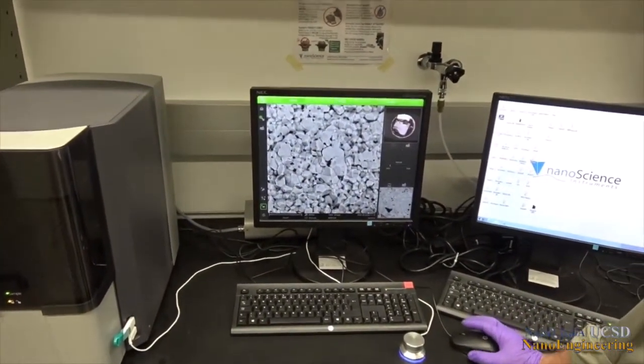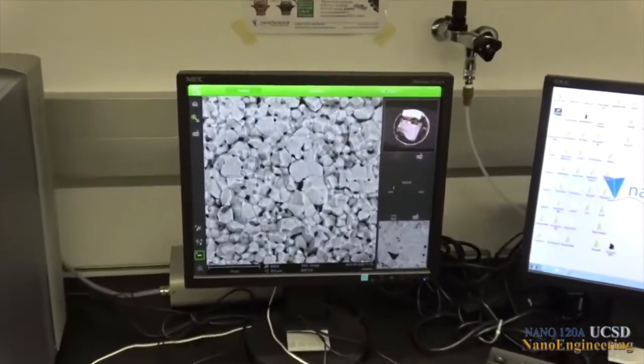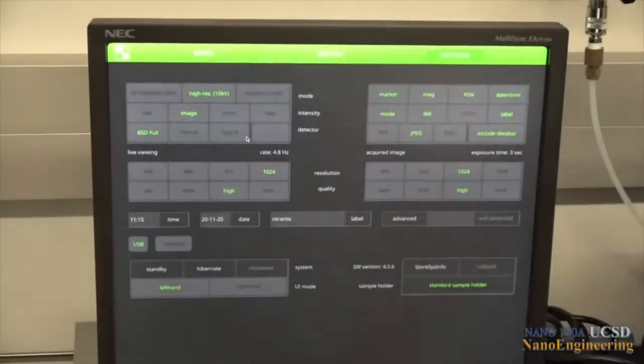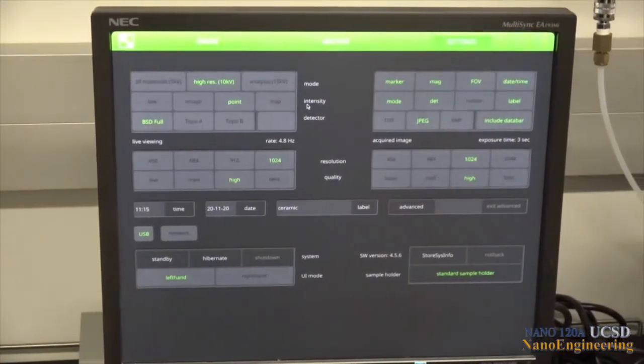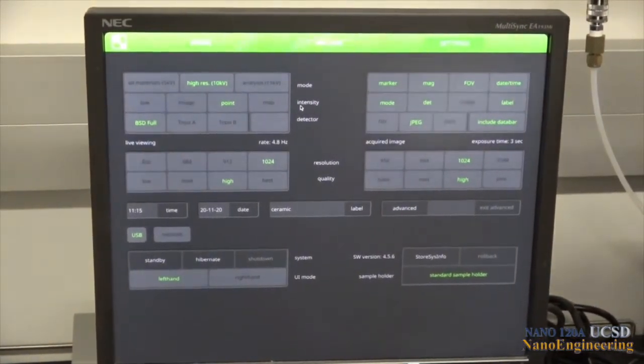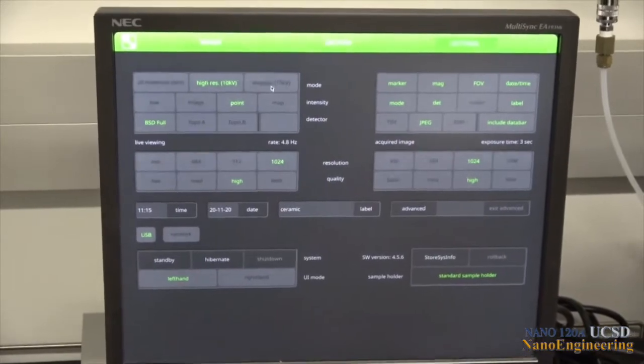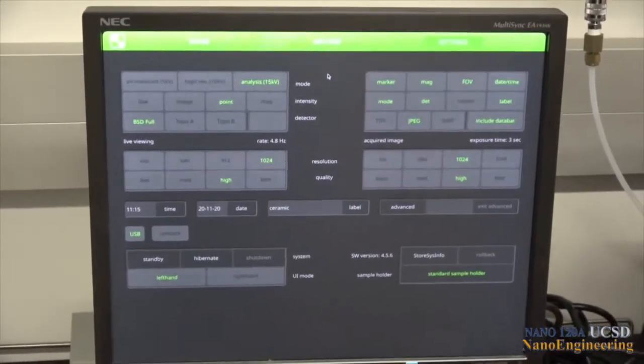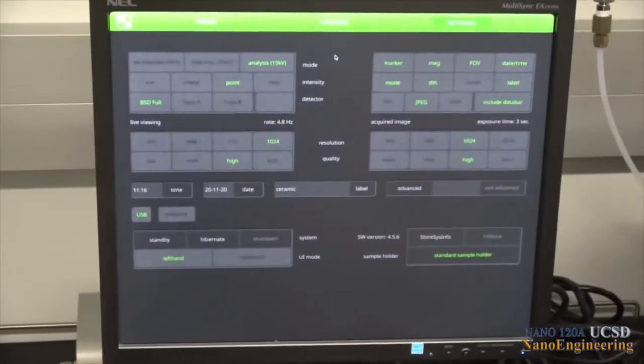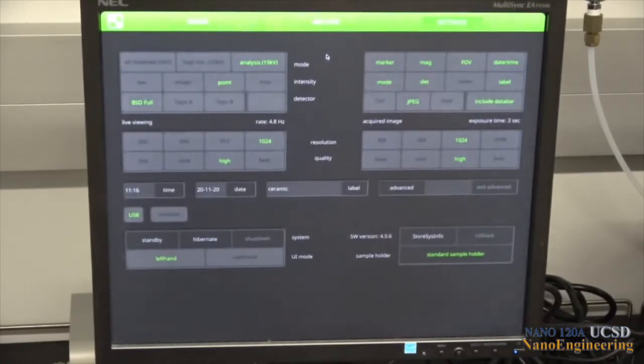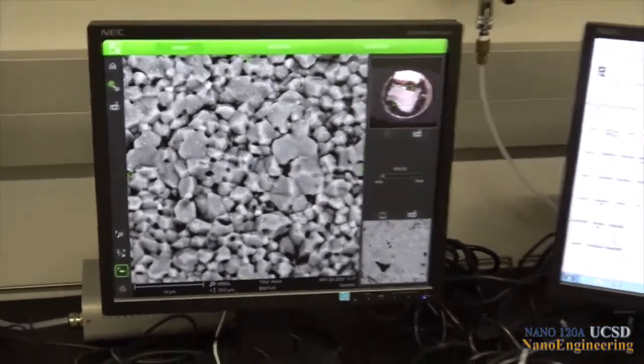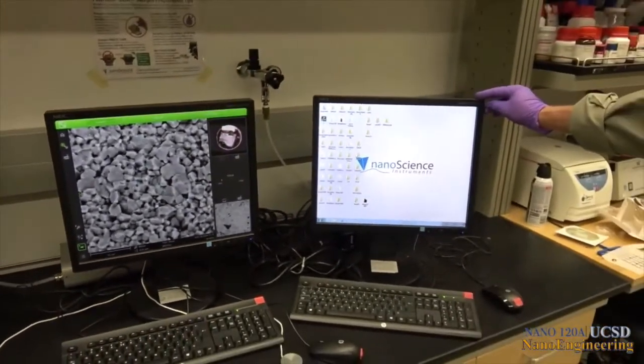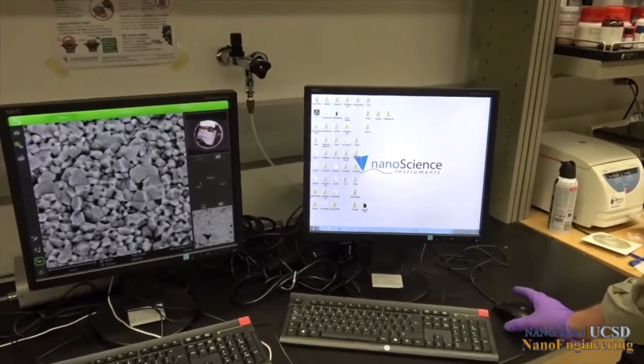Chemical analysis of the sample can be performed with the energy dispersive spectroscopy option on this microscope. We first set up our microscope for the X-ray analysis by going into settings and setting the beam current spot size to point mode and selecting the 15 kV accelerating voltage. Because we changed our imaging parameters, we will have to refocus the image once again.